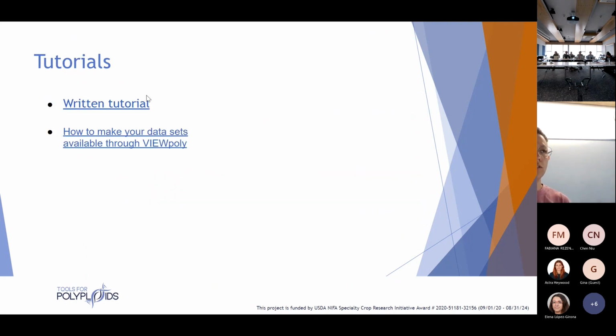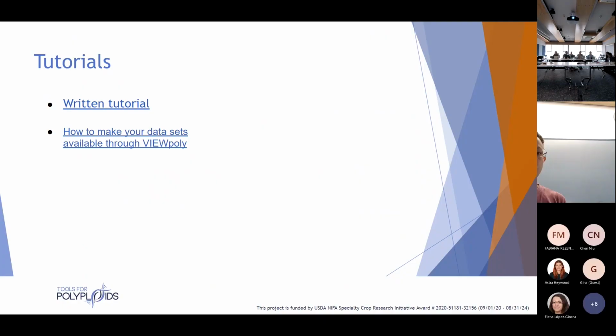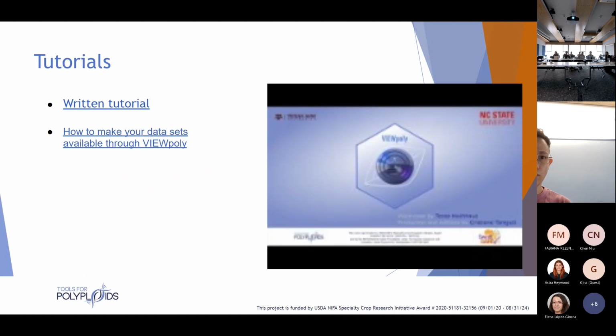I include here links for the tutorials, but it's all on this GitHub page. So links for tutorials for everything, and also for how to do it with your own data set if you want to deploy this in a server.